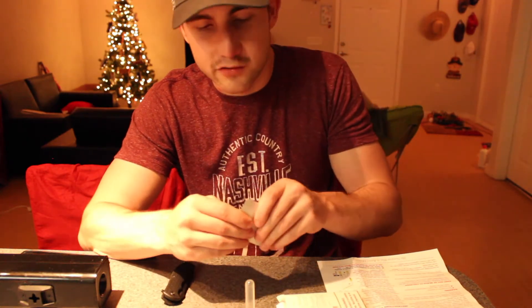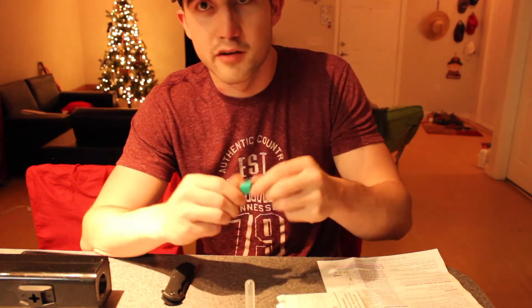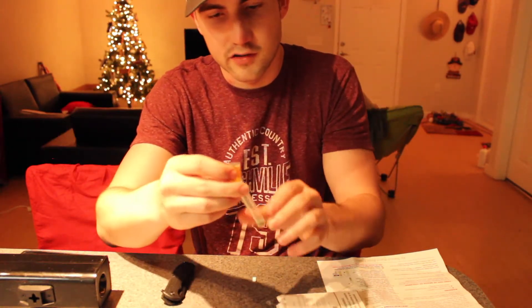Then we're going to open a fresh Juul pod — never been used, fresh out of the pack. Take the lid off of it and pour some of that solution in.